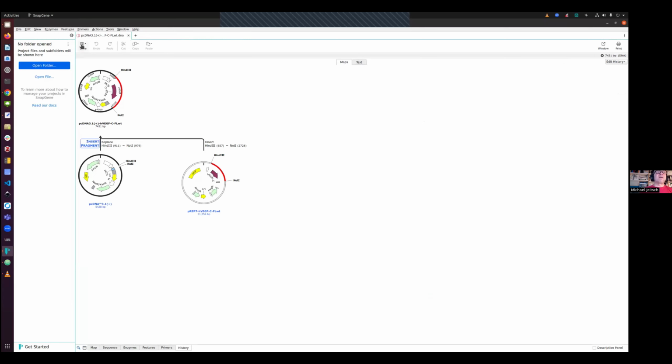And once you have saved this one in this new file, you will have the full sequences of these originating plasmids together with the way how you did the subcloning. And that is important. You want to have one single file, which basically describes everything what you did in the lab.